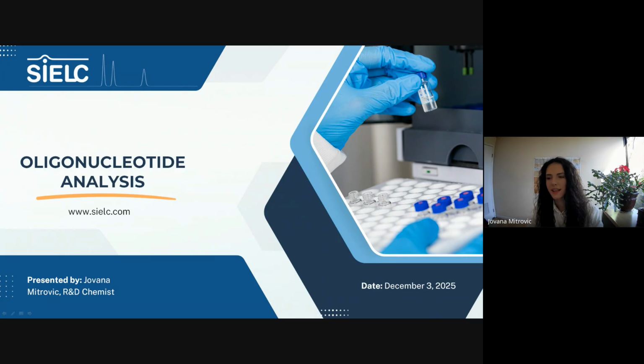Today, we will be discussing a topic that's becoming increasingly important in modern bioanalysis, oligonucleotide analysis. And I'll share some of the innovative solutions we have developed for their characterization and separation. So we will go beyond traditional LC principles to understand why oligonucleotides are so challenging to analyze and how we can overcome those limitations using our bridge ion separation technology, or BIST.